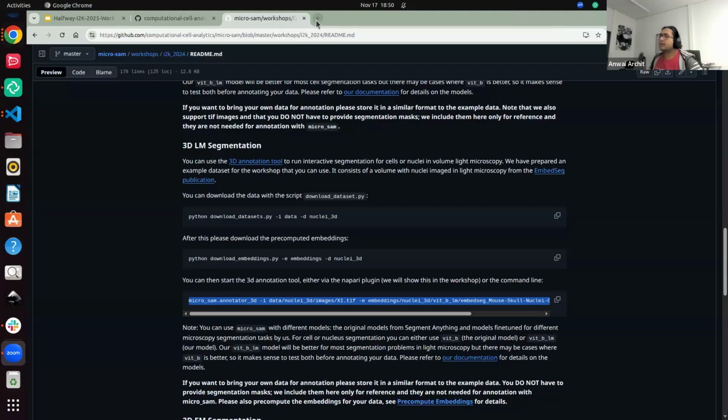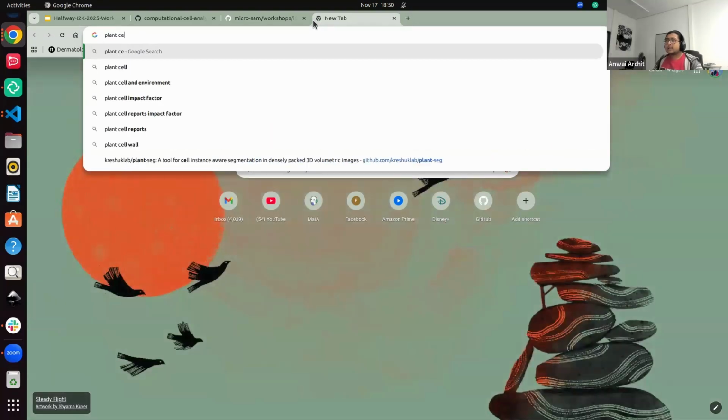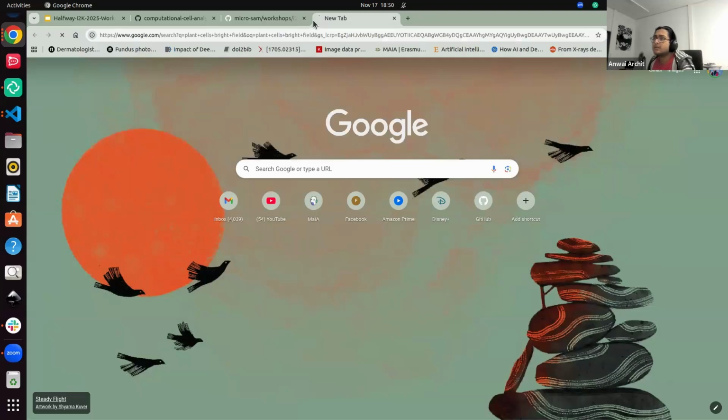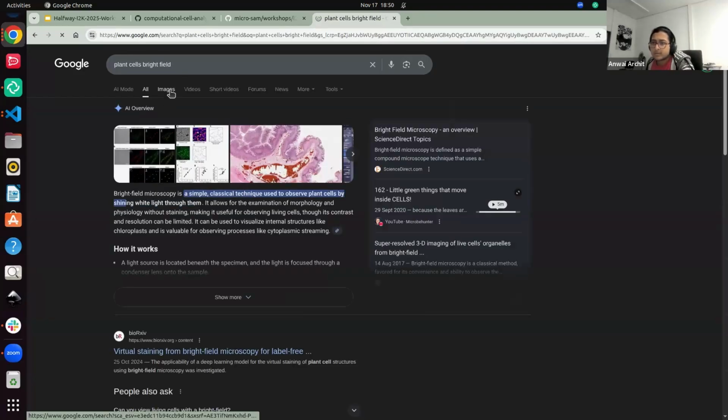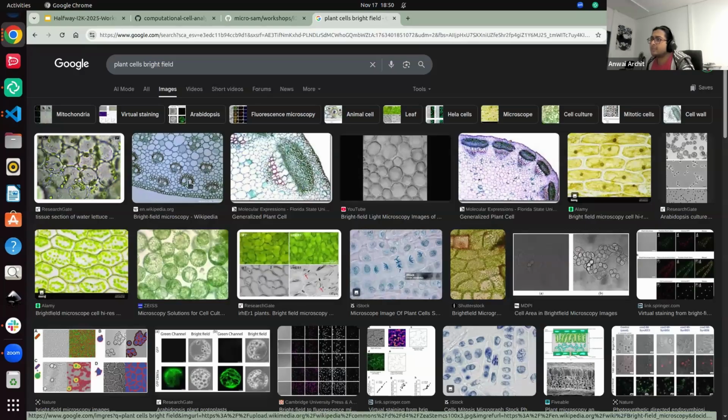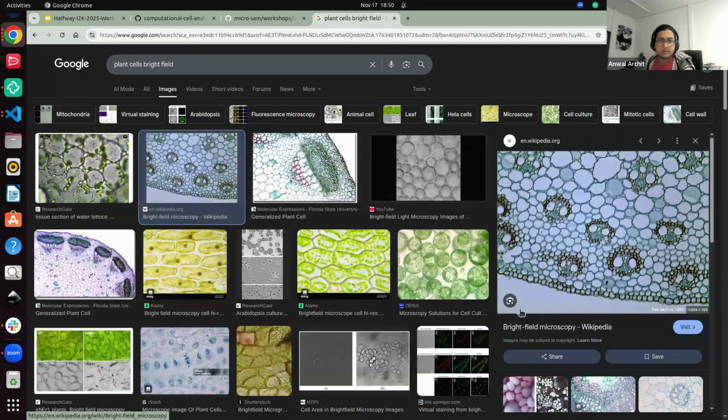Okay. Plant cells. Bright field. I'm very curious. So would you say this is one of the good examples over here? Because I think I am looking for one. Okay, perfect. I'm waiting. In case anyone has any other questions, please feel free to shoot a question. Happy to answer.